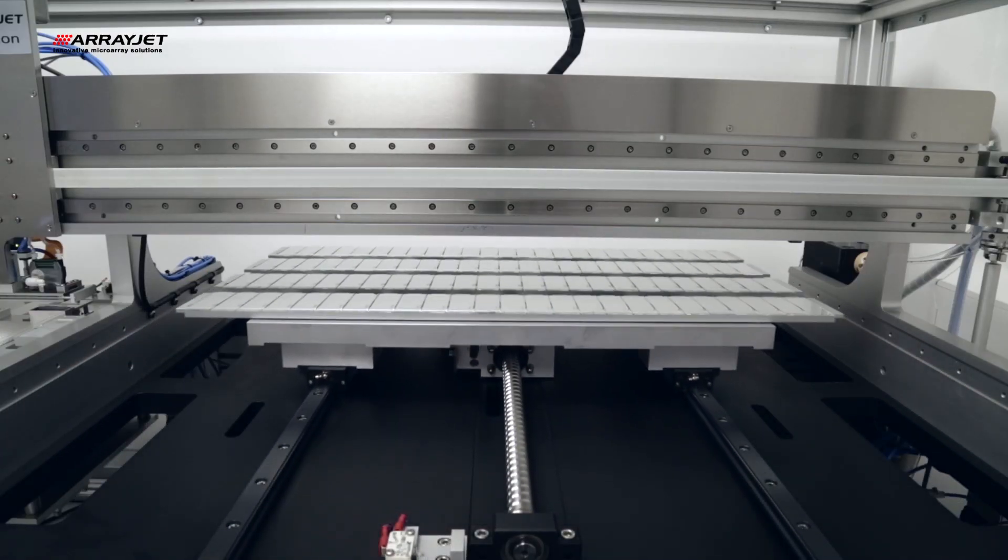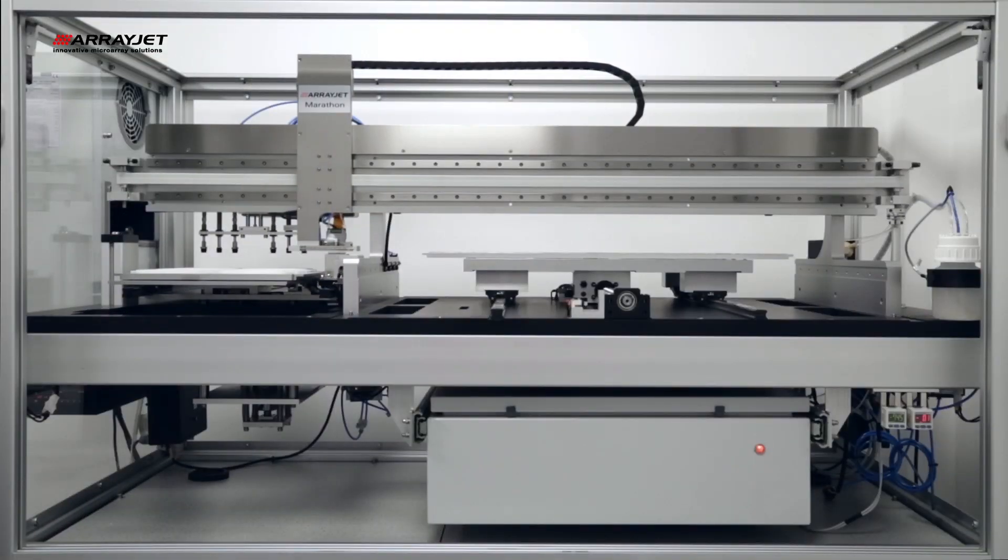Its printing technology is the fastest on the market and produces the largest batch sizes, available in one print run of 1,000 slides.